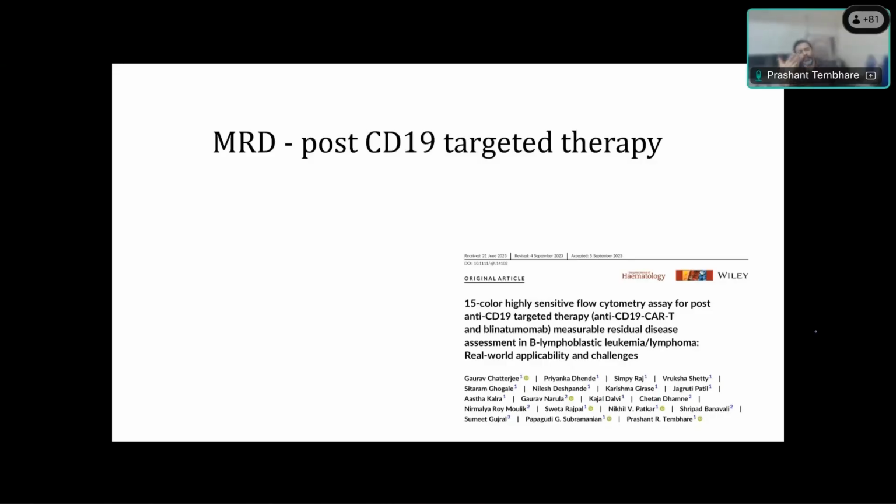You can also look at CD20, because CD20 also changes from stage 1 to stage 2 and stage 3 hematogones. So the markers which show variable expression from stage 1 to stage 2 or stage 3 can be combined with CD73, because we know CD73 also shows variable expression from stage 1 to stage 3. Those combinations are more fruitful in terms of detecting aberrance and asynchronous expression.